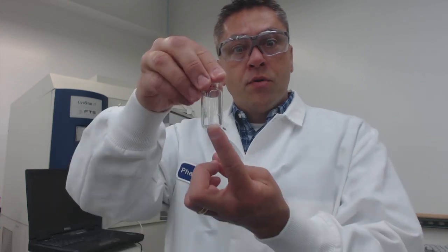What we hope not to do is produce something like this. This is collapse. This occurs if we don't understand the thermal behavior of our product and we exceed critical temperatures during primary drying. So that's what we want to avoid.